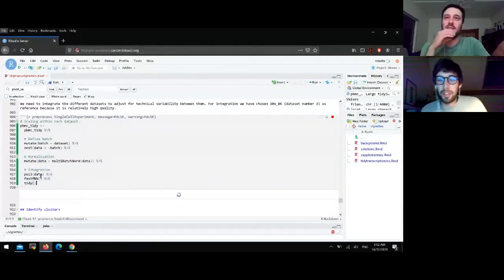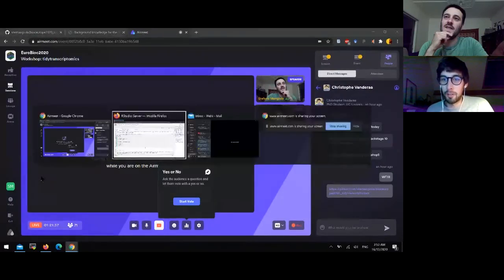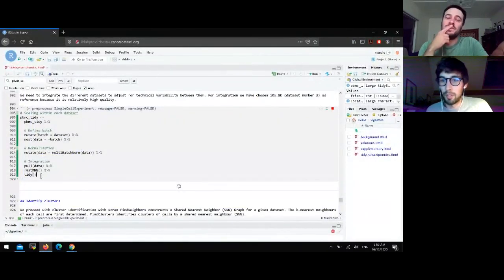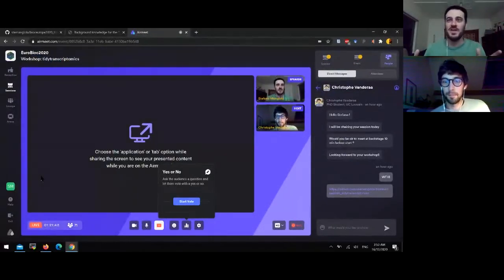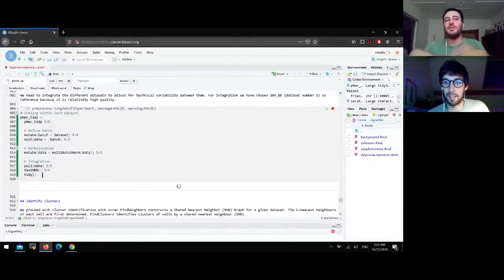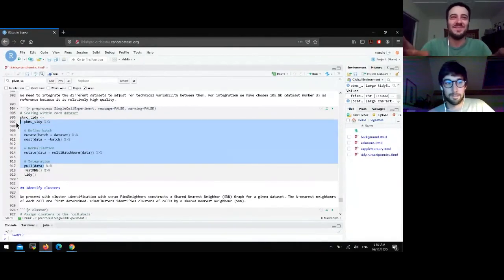So usually we would expect a single cell experiment object, and then we would not need to do that. But here, because this function expects lists of single cell experiments, which is maybe not standardly expected from using the tidy framework, then you need to go and do this. Yes, the problem is that it inputs a list and outputs a unique object, two different shapes. So for this reason, we have to pull the data out and tidify back. I would show you how the list looks like, but let's see.